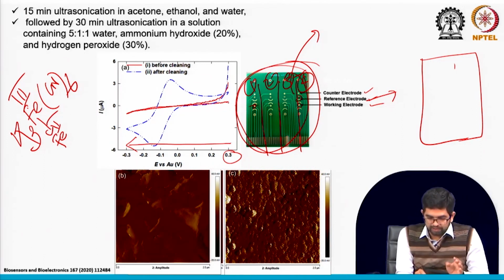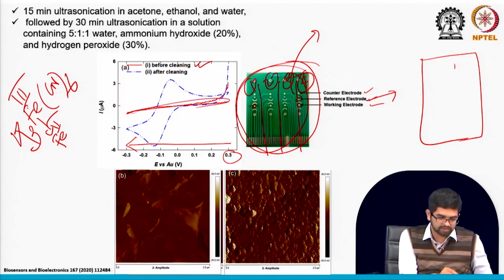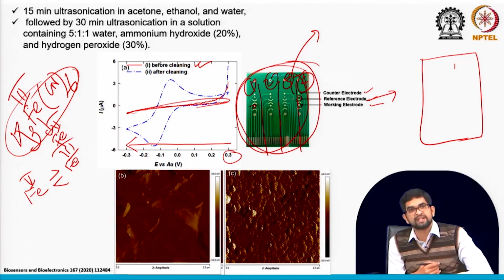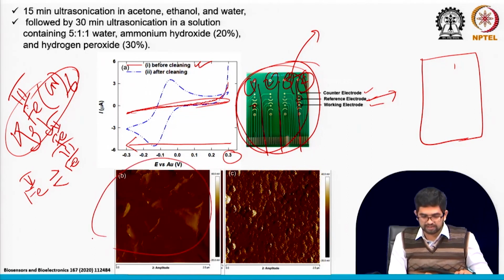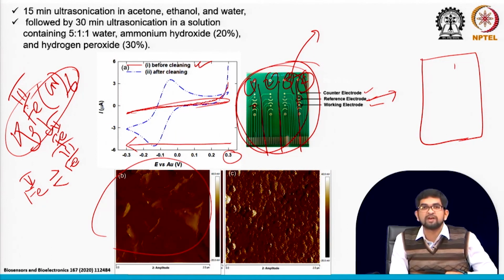See in this red one, the first one, this is before cleaning. When we didn't use any kind of pretreatment or cleaning method, you can see there is almost no peak. There is no reversible Fe2, Fe3 peak that you can see, because your surface is too contaminated when you receive it from the PCB factory. When they are fabricating the PCB, there is lots of contamination there. That's why I wanted to show you an AFM image of the printed circuit board that we received from the PCB factory. Immediately before cleaning, you can see almost the surface is covered by some contaminant.